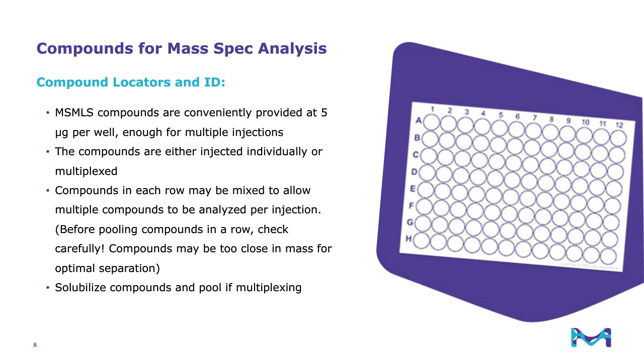But rather than 600 individual injections, the library may also be analyzed as simple multiplex injections. So if individual rows are pooled, and this is done for every plate, then the entire collection may be analyzed in only 56 injections of simple mixtures.